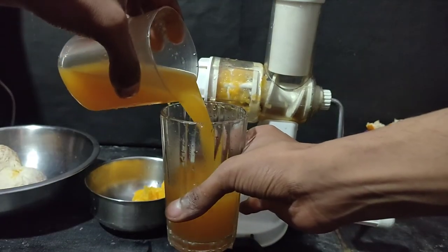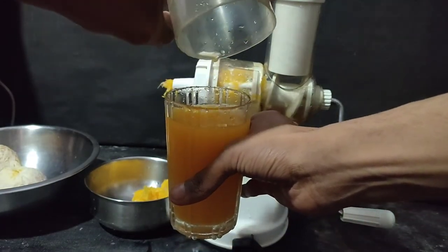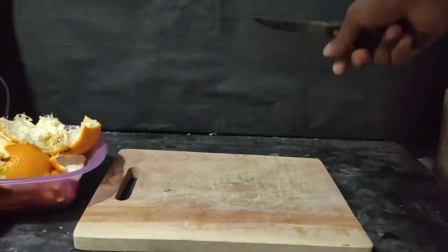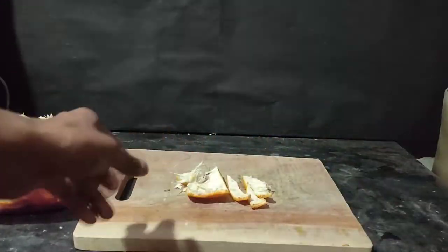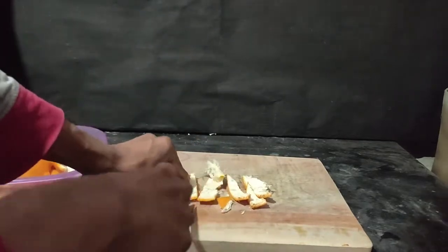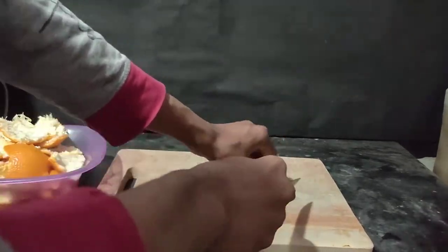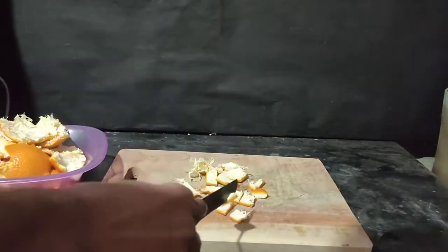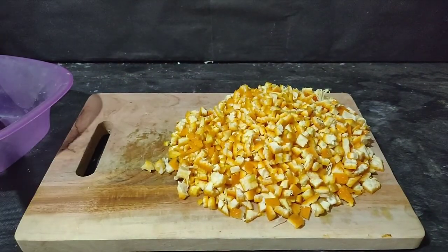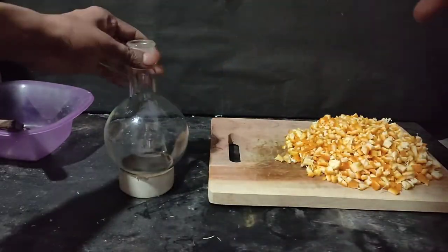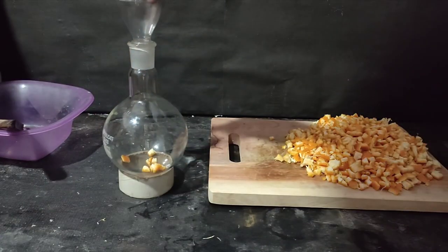My orange juice was ready. What should I do next? So I decided to extract limonene from these peels. For that, I cut the peels into small pieces. After chopping the peel, I transferred them into a 500ml round bottom flask.